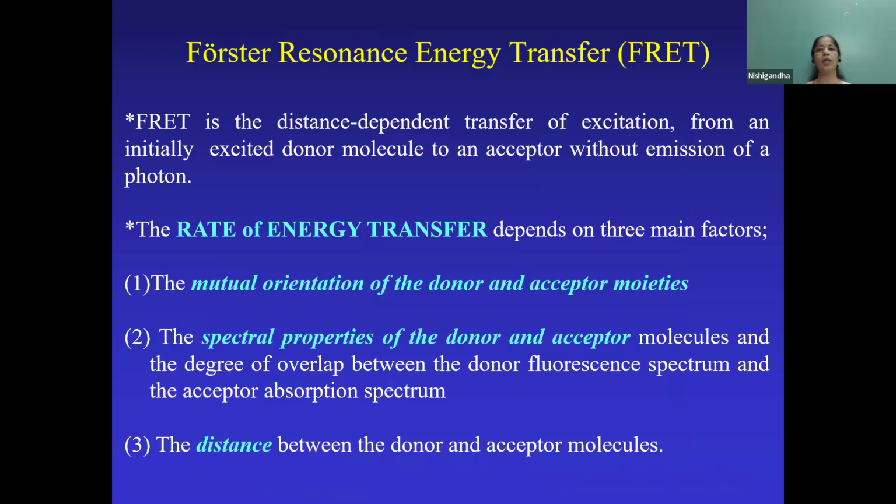So there is another technique known as FRET. FRET stands for Förster Resonance Energy Transfer. It is a distance-dependent phenomenon. There is a transfer of excitation from an initially excited donor molecule to an acceptor molecule without emission of photons. That means you don't see emission or fluorescence of the donor molecule, but you see emission of only the acceptor molecule, provided there is FRET between the two, provided they are together.